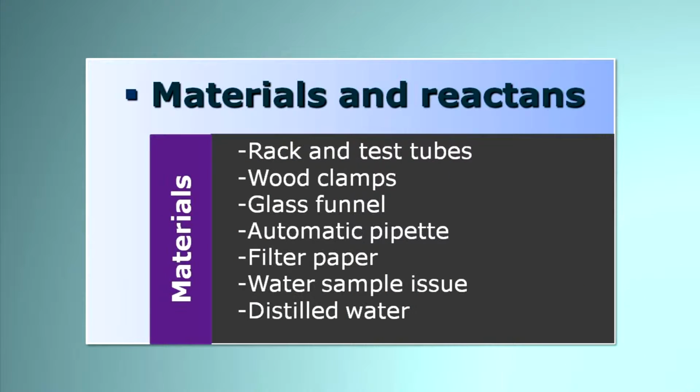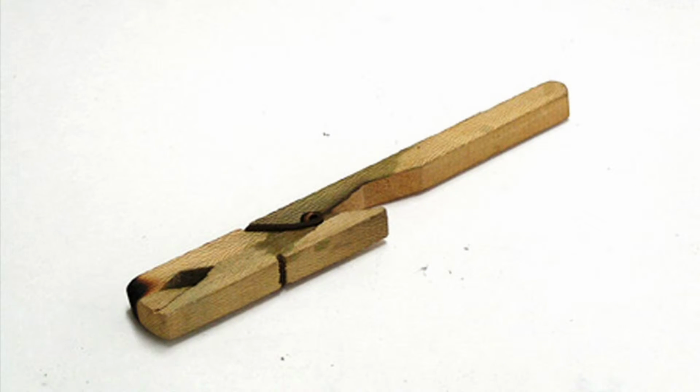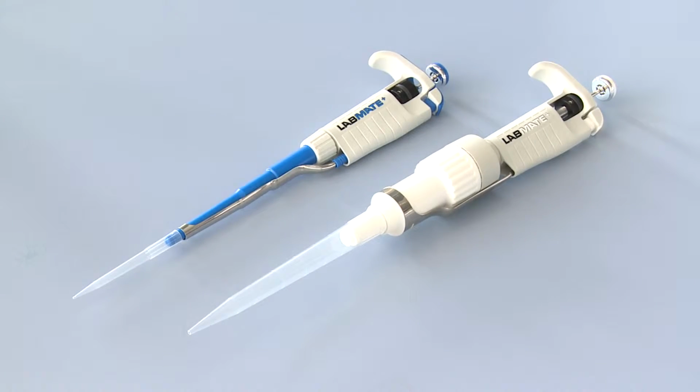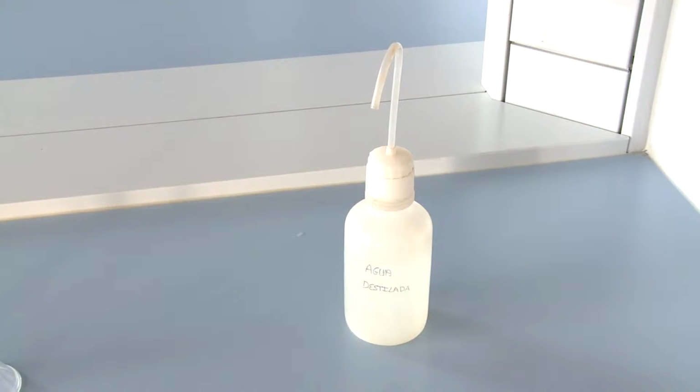Materials and reactants. The following materials are required to do the assay: rack and test tubes, wood clamps, glass funnel, automatic pipette, filter paper, water sample issue, distilled water.